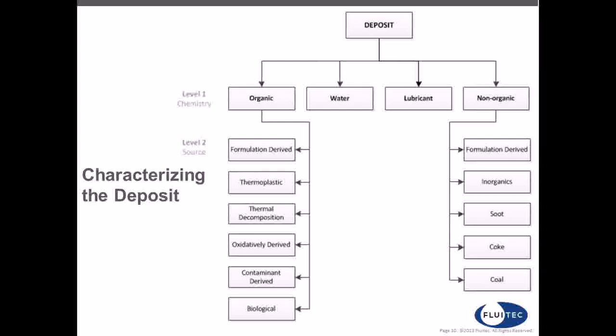Inorganics is another type, and inorganics is essentially free of carbon. Non-organics is a general category of deposits that don't exhibit organic-like nature. They're insoluble in highly polar solvents, and they don't exhibit carbon-hydrogen spectra. Inorganics truly are free of carbon of any kind.